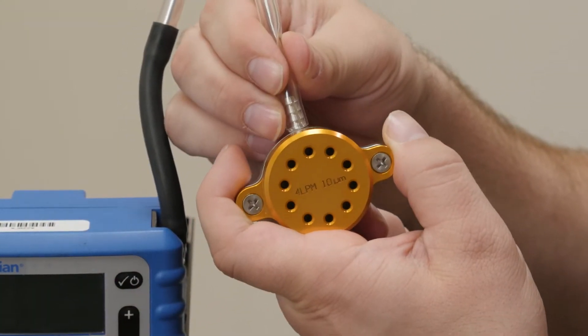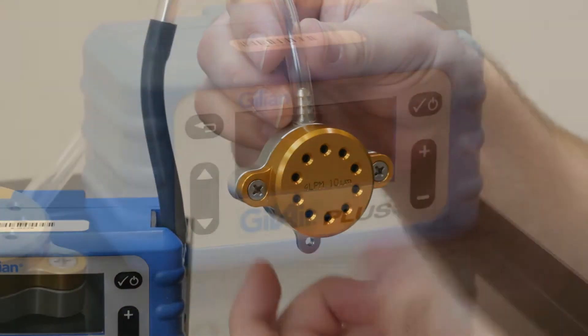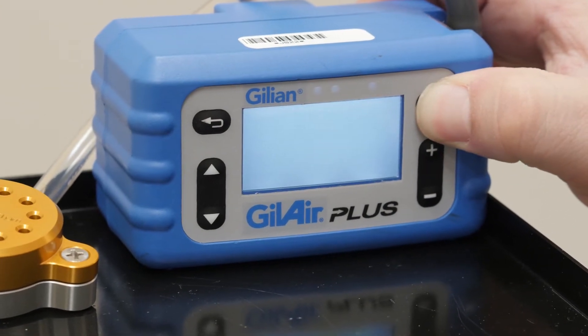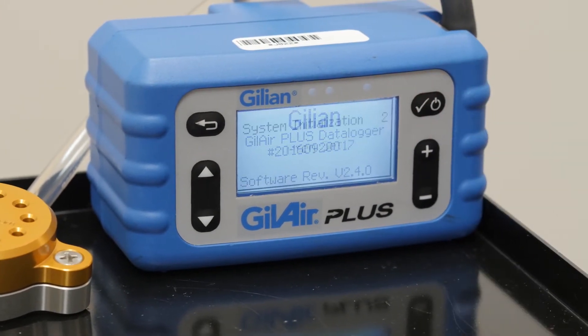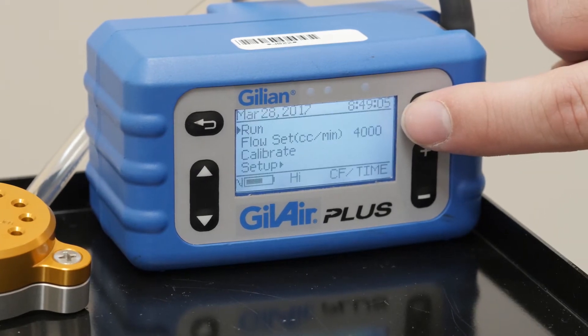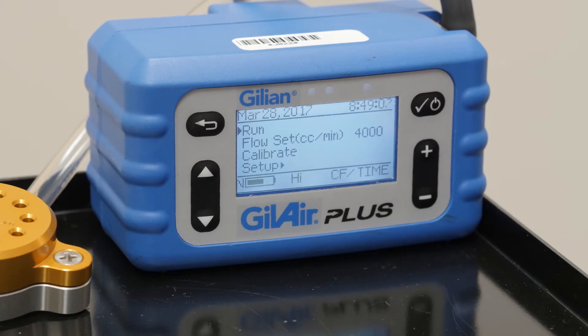Connect the silver connector to the open end of the tubing. Turn the pump on by pressing the checkmark power button on the pump. You will see that the flow set is reading 4000, which indicates a 4 LPM flow rate.